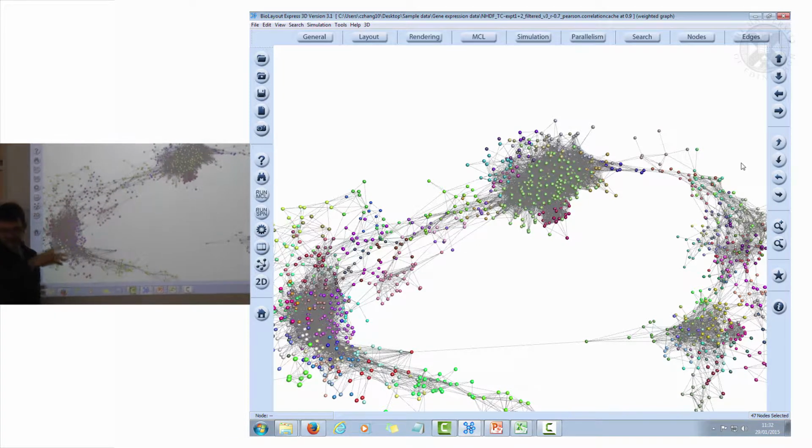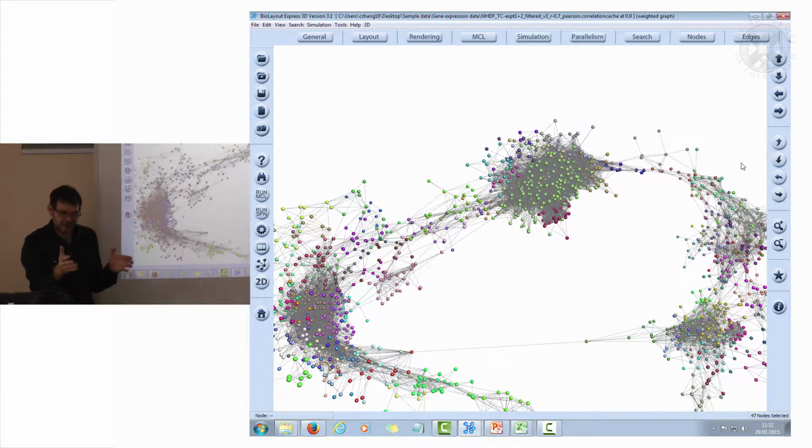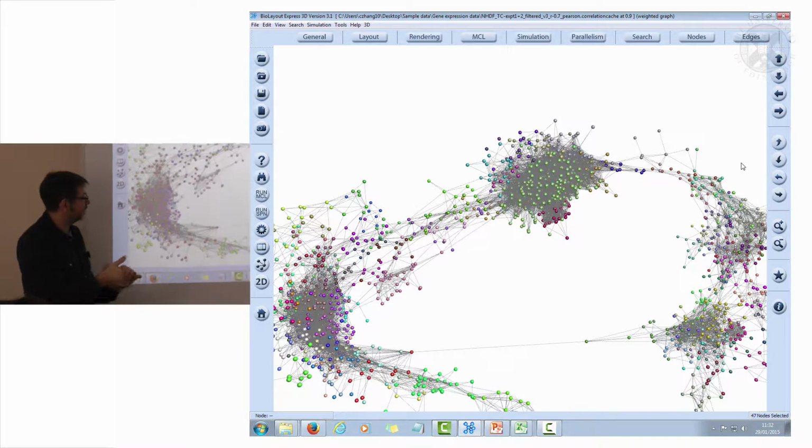So what you've actually captured here is, we've done quite a simple experiment, but the answer is quite complicated, if you know what I mean. There's a lot of detail, a lot of interest here.